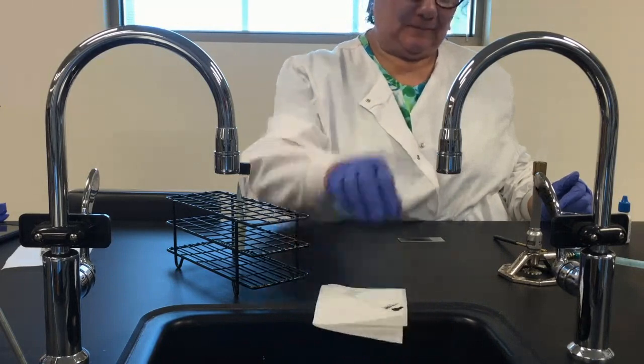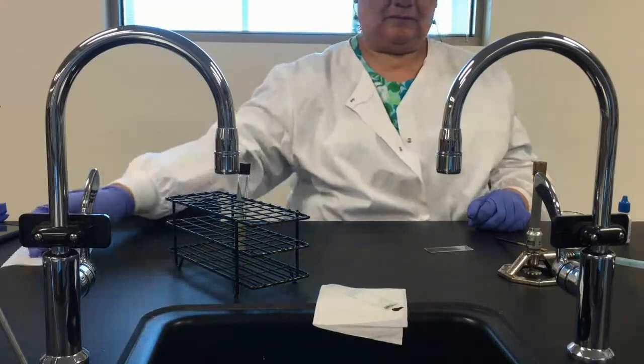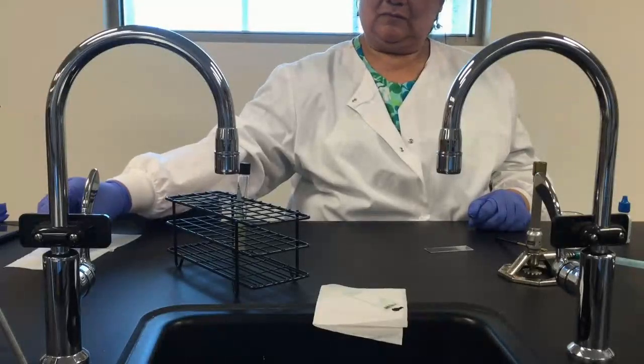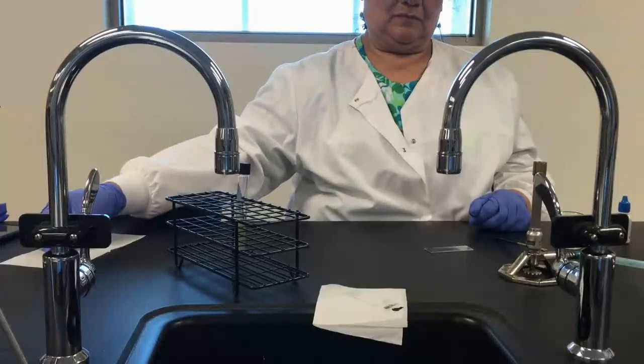Okay, now we're going to let this slide air dry thoroughly. We will not heat fix, and we won't put the slide on the slide drying rack either, because it's just going to get too warm. If we do that, or if we heat fix the slide, even if there are capsules present, they're going to just shrivel up from the heat. So we're going to let that negative stain air dry completely.